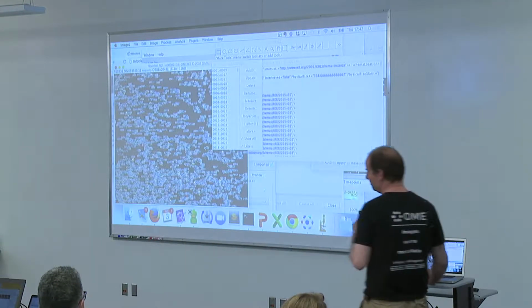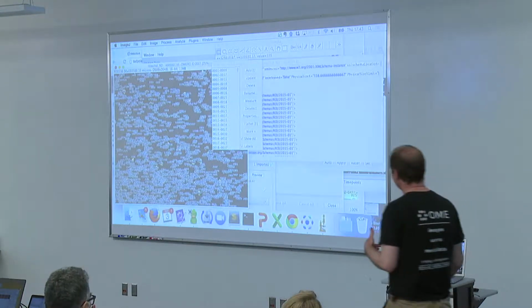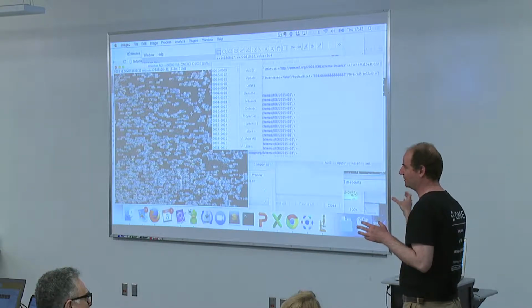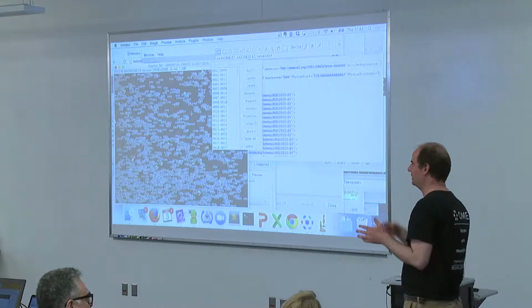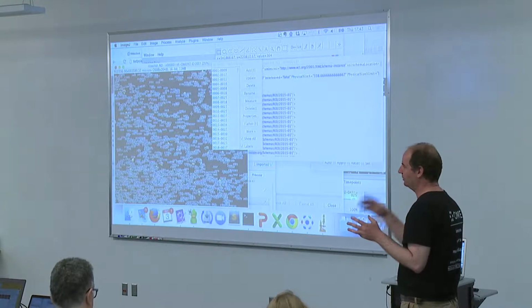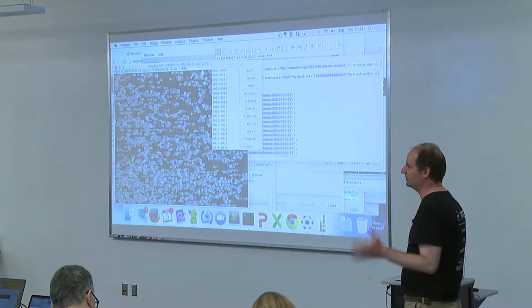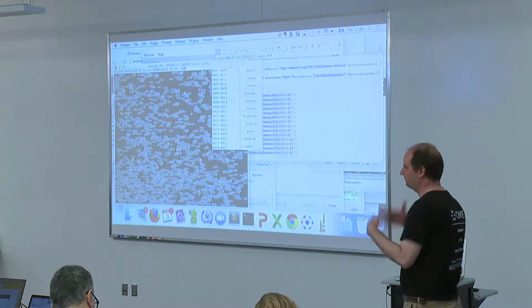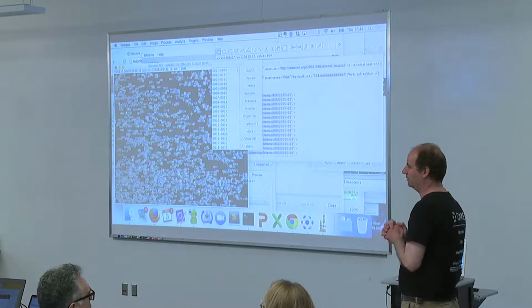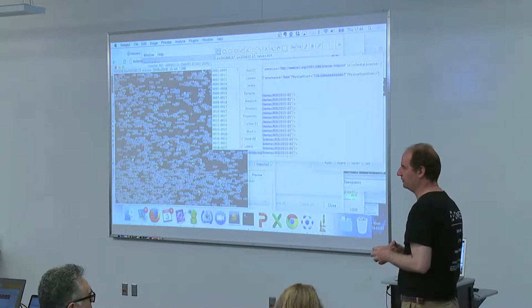Right. So this is the image which I reopened now from OMERO. This is the image I saved to OMERO. So you saw that these OMERO regions, which I was showing you in Insight, which were previously ImageJ regions, I transferred them into OMERO regions. Now I'm reopening the image in ImageJ. The OMERO regions were transformed into ImageJ regions, and I can continue with my analysis after 3 weeks. After I've, of course, restarted ImageJ and lost all my data on my local desktop, I still am able to continue my analysis at this stage. Yes, please.